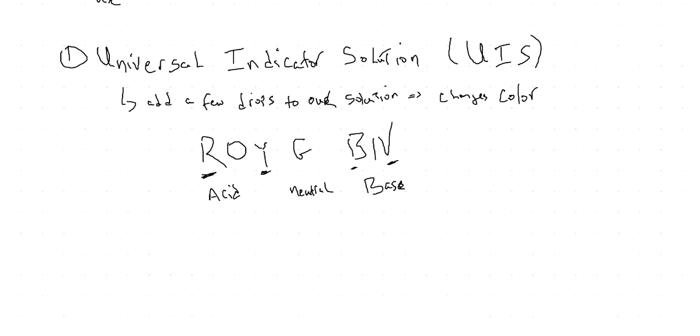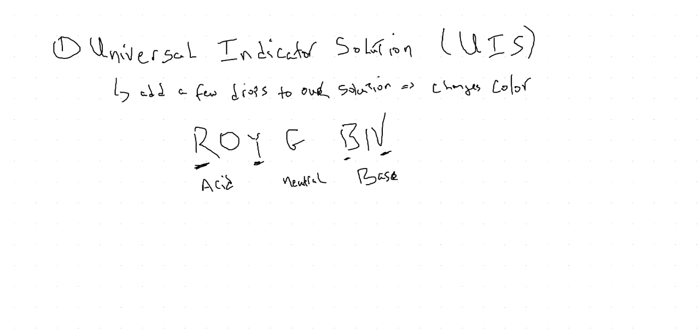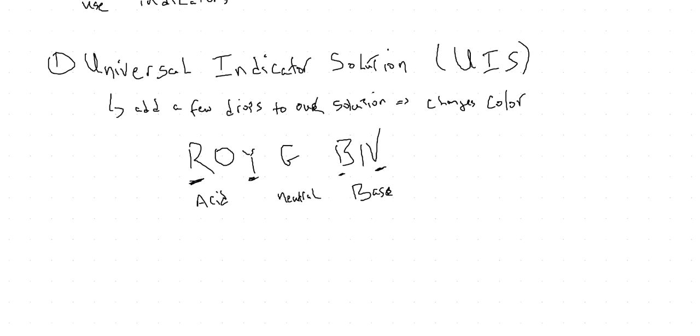All right, the second indicator is called phenolphthalein solution. This is a tough one to spell. Phenolphthalein solution.